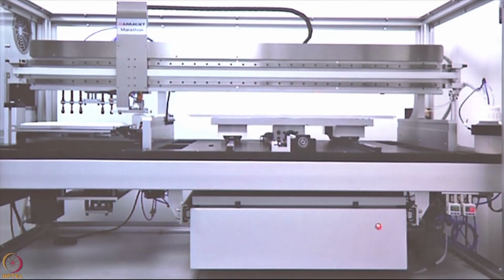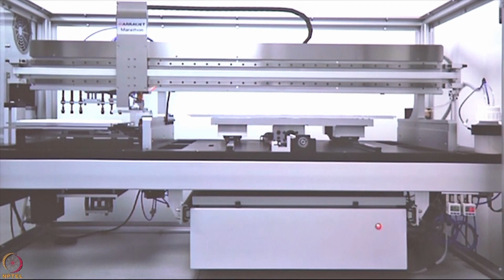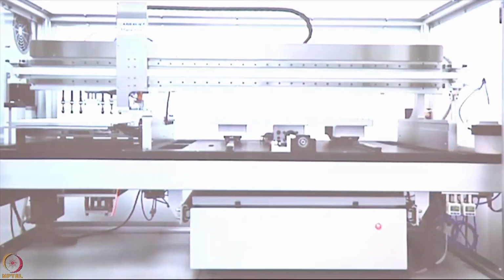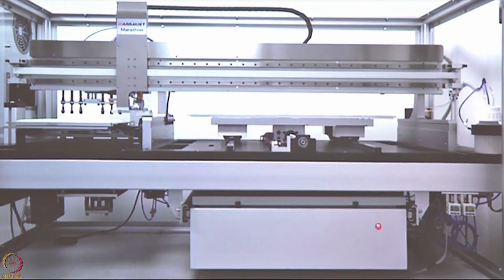This is the washing cycle. This is where the washing happens. And once the washing happens, which is the bit which takes some time, because it's very critical to wash your one set of 12 samples to avoid any contamination, we want to make sure these are some of the spots we've printed with label-free technique. And I believe they are not printed on a slide, they are printed on a completely different surface.